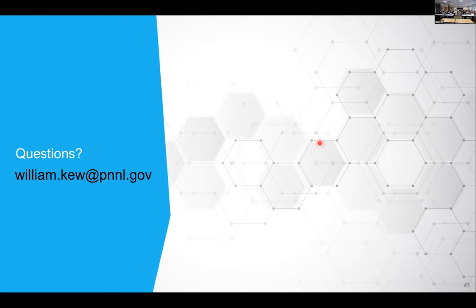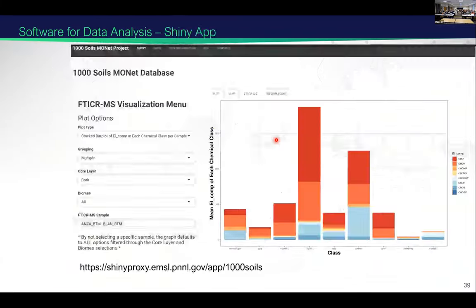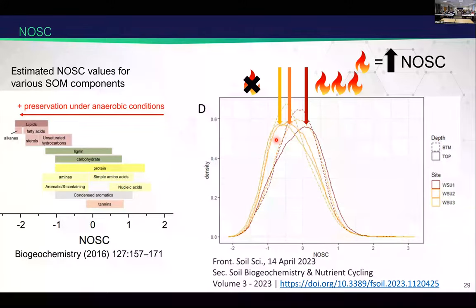When you do the molecular formula assignment, you use a confidence index or value. So I want to ask how you get to that confidence value and how you use it, like when the value is larger than 0.6 or 0.8, then you are confident with that assignment?